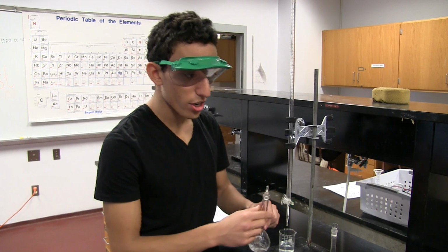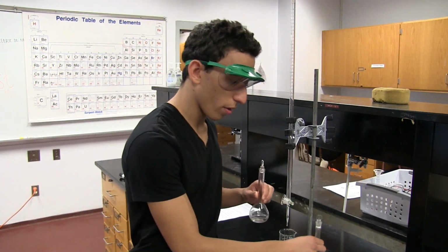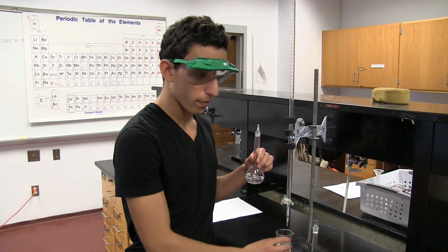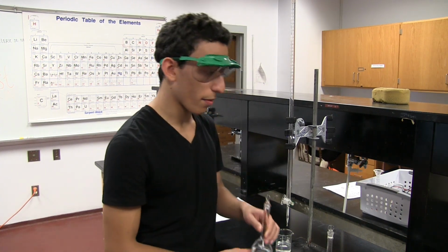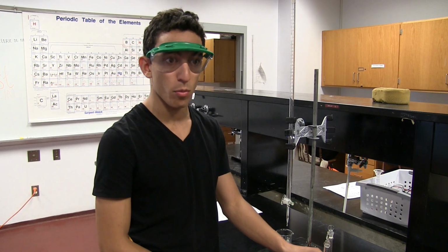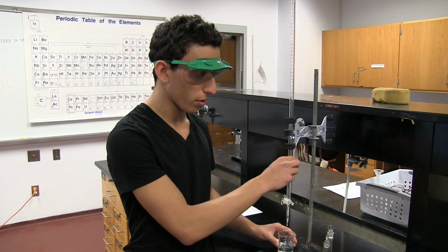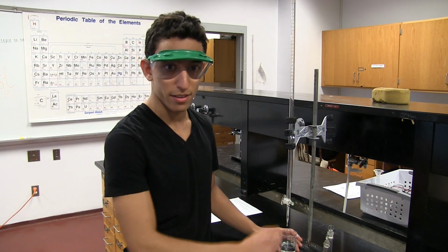Okay, so for the titration, you're going to take one of the stock solutions and titrate it into the other one. The one that you're titrating should be the known concentration, and you're going to titrate it into the known volume of the other solution. That way you can calculate the exact volume that's needed and you get a more precise value of Ksp. So once you start to see the gold flakes, that's exactly how much volume you're going to need, and that will be the molar solubility, and use that to calculate Ksp.